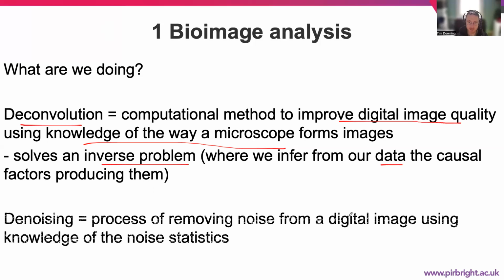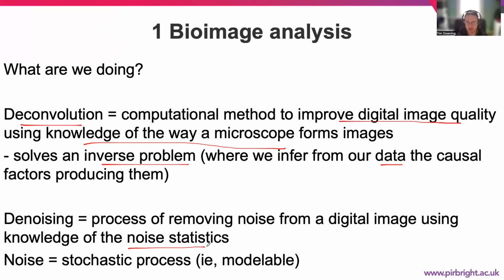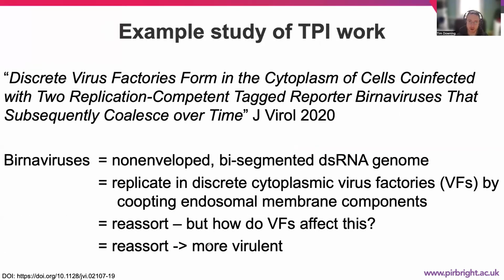We also need to denoise or remove noise from the image using our understanding of noise statistics, bearing in mind that noise is a stochastic process, and therefore you can model it and integrate it into our different approaches. There's an example paper that we'll talk about next.